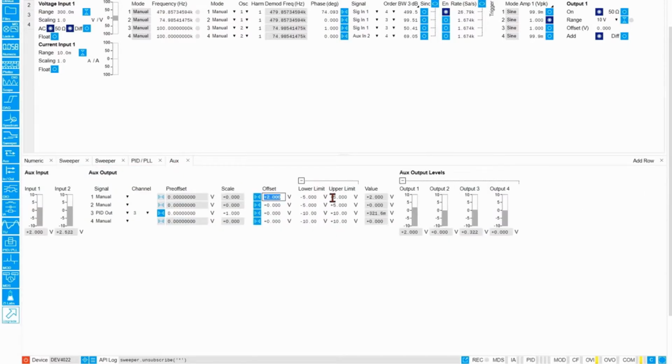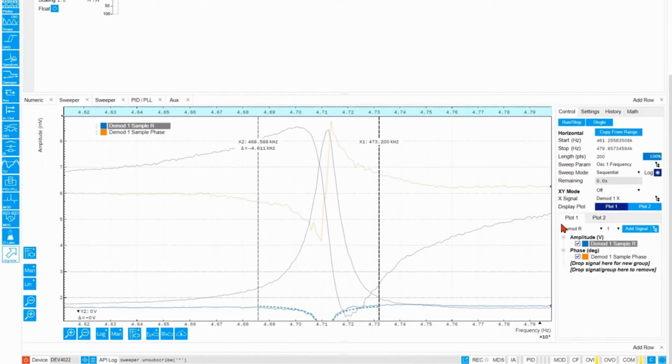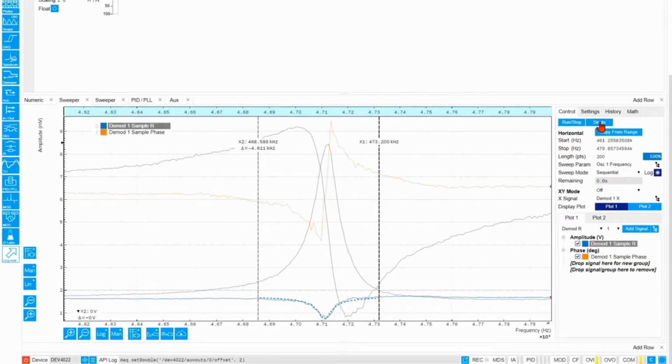And just for the sake of argument, if you put here 0 volts, there would be a much weaker electrostatic interaction, so of course the overall amplitude gets much smaller. It's not 0 because it's not necessarily the CPD, but it is definitely much smaller. So let's go back to 2 volt, where we have good signal strength. With this, we can further optimize the signal.